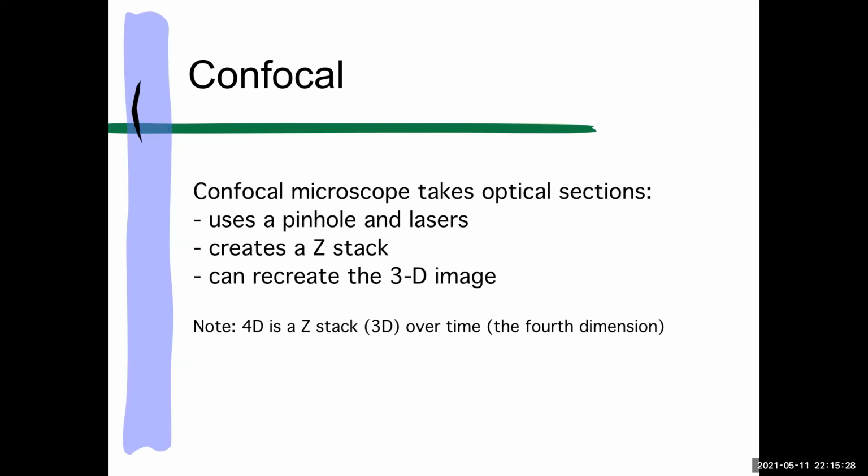And software can then recreate the 3D image for you. You might hear people talking about 4D, that's a Z-stack, which is 3D over time, the fourth dimension. Marketing will use things like 6D, which is just like different colors in 4D or different locations or whatever.